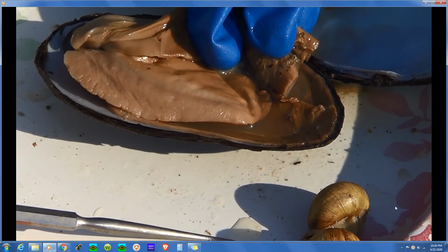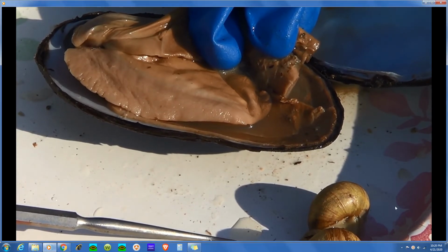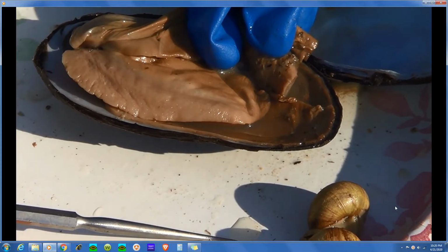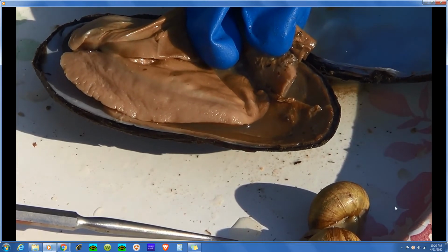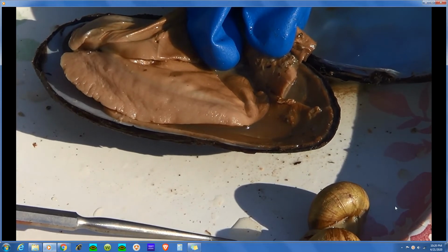These things are different. They have an open circulatory system. And in an open circulatory system, the body cavity is full of blood, and it nourishes all of the internal organs from the outside. Okay, for us, blood vessels bring blood into the liver. Blood vessels bring blood into a muscle. So our organs are nourished from within. Their muscles are nourished by soaking in blood that fills the body cavity, which is very, very different from our own. So they have an open circulatory system.